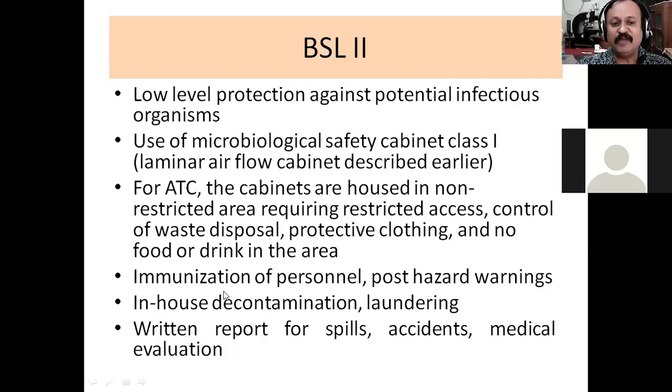Then in-house decontamination is there. What is the meaning of in-house decontamination? After the use of the material, even the apron, the gloves, or if you are using a face mask, all this material should be decontaminated within the facility itself. It should not go outside that facility. Sterilization, for example, or autoclaving of this material must be done within the facility.